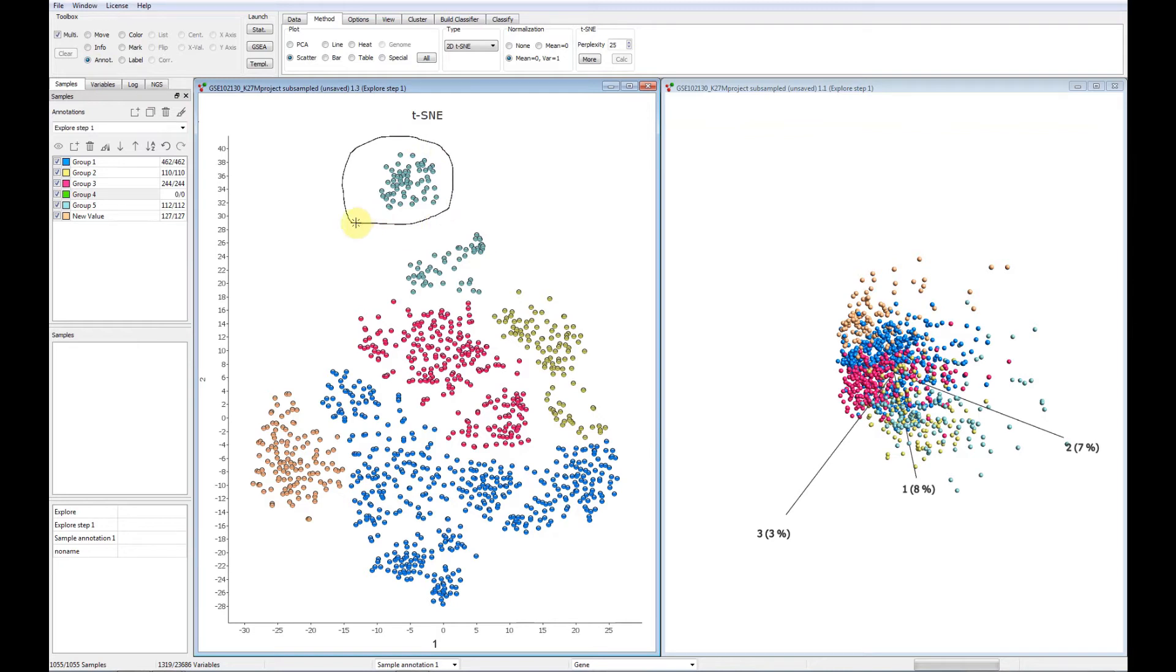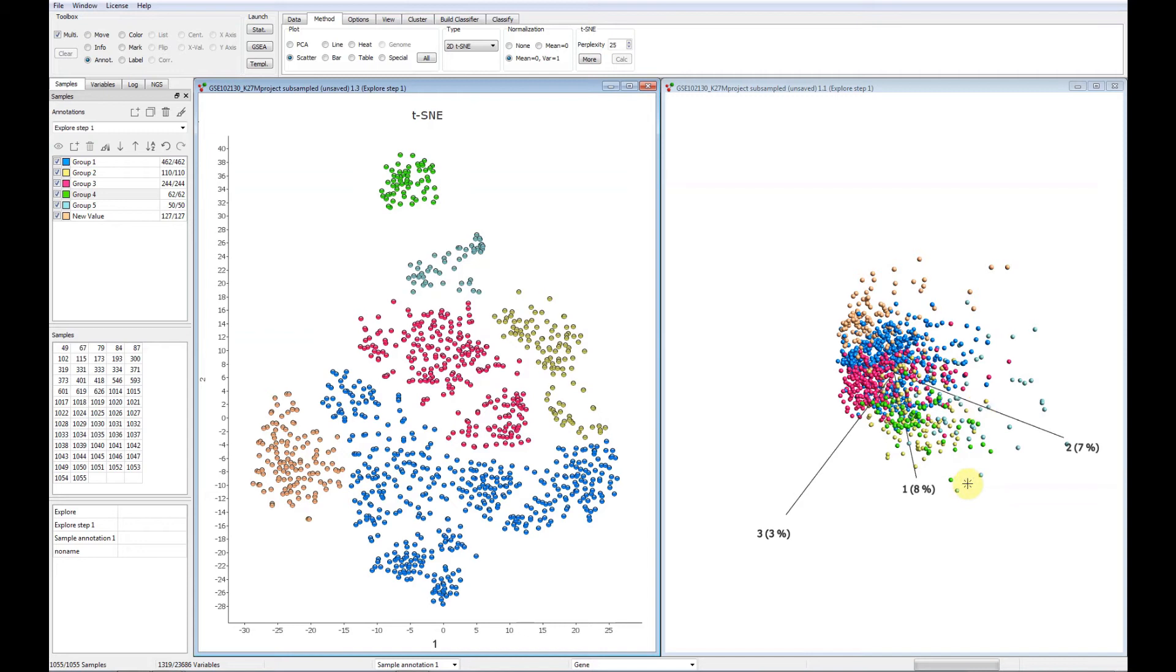This can be done in either of the plots. See now how the samples in the PCA plot are updated instantly.